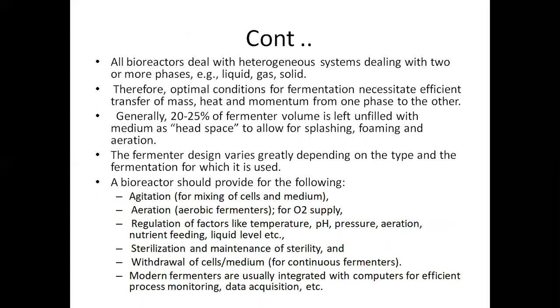All the bioreactors actually deal with heterogeneous systems, that is there are two or more phases. There has to be a liquid phase, gas or solid phase. Basically, there is more than one phase, that is either liquid-gas, liquid-solid or solid-gas. So basically, these contain heterogeneous systems, and there should be optimal conditions for fermentation, and there has to be efficient transfer of mass, heat and momentum from one phase to another.